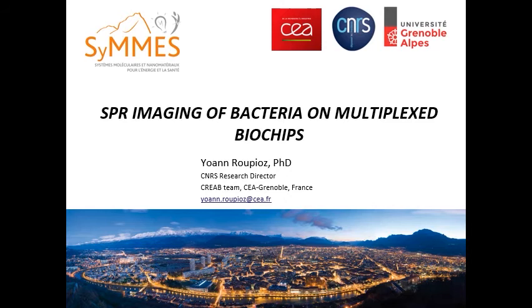for the invitation to present some of our work based on surface plasmon resonance imaging that we developed for the detection of living bacteria. Most of the results presented today have been achieved in our group based in Grenoble, in France, where we acquired some experience on the SPRi biochip engineering and processing for several applications such as food safety, biomedical analysis, or environmental controls.